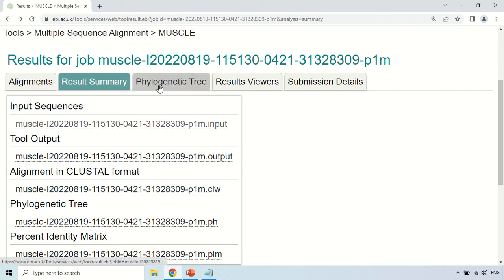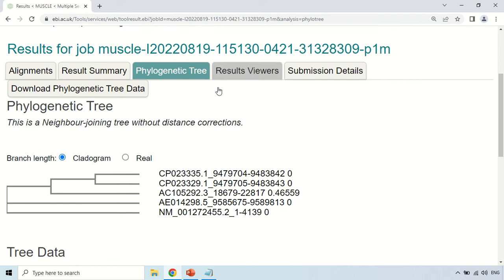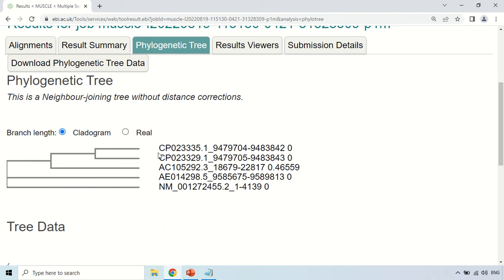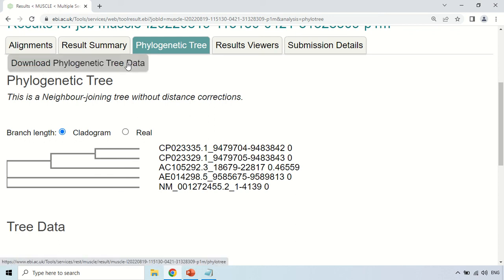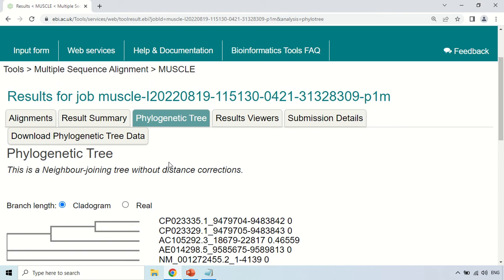Now comes the Phylogenetic Tree option. If you click here, the tool will generate a phylogenetic tree for you. As you can clearly see, this is the phylogenetic tree of the five sequences I gave to the tool. These are the accession numbers — this information is about the sequences. This is the cladogram or phylogenetic tree generated according to their alignment result. You can also download this tree data under the 'Download Phylogenetic Tree Data' section. So by using this MUSCLE tool, you can perform multiple sequence alignment and also generate a phylogenetic tree.